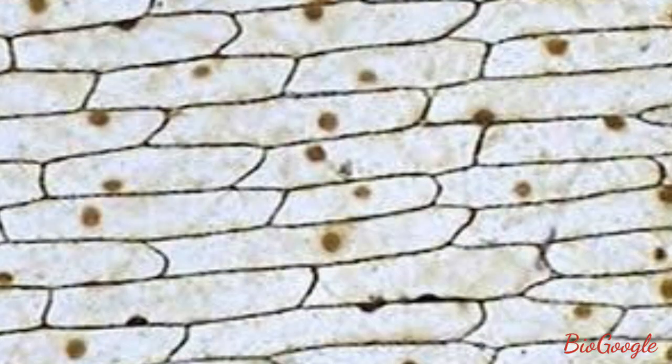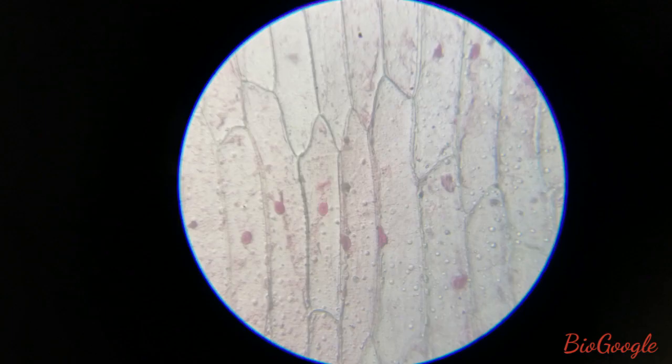When we focus the prepared slide on the microscope, this is how the cells look. This is the actual image observed under the microscope, usually on the 10x objective of the microscope.